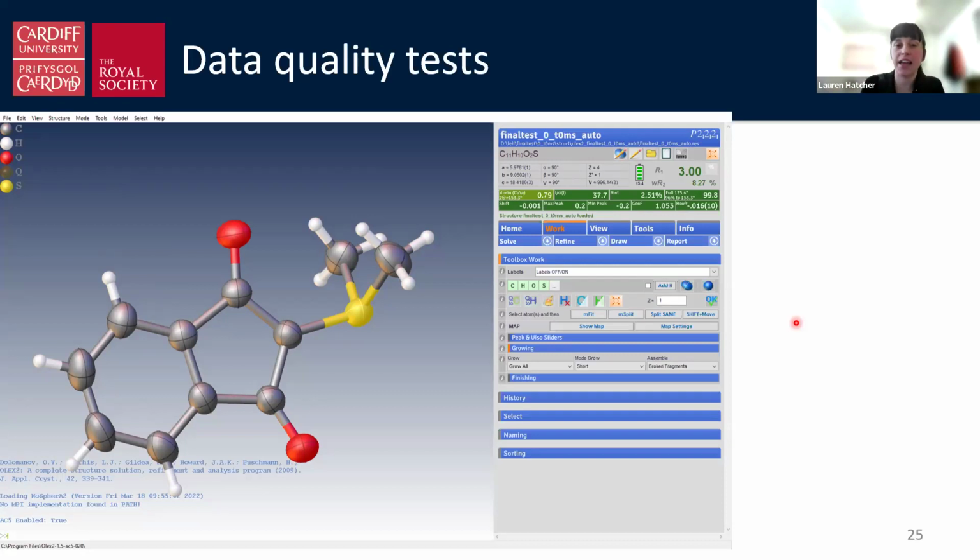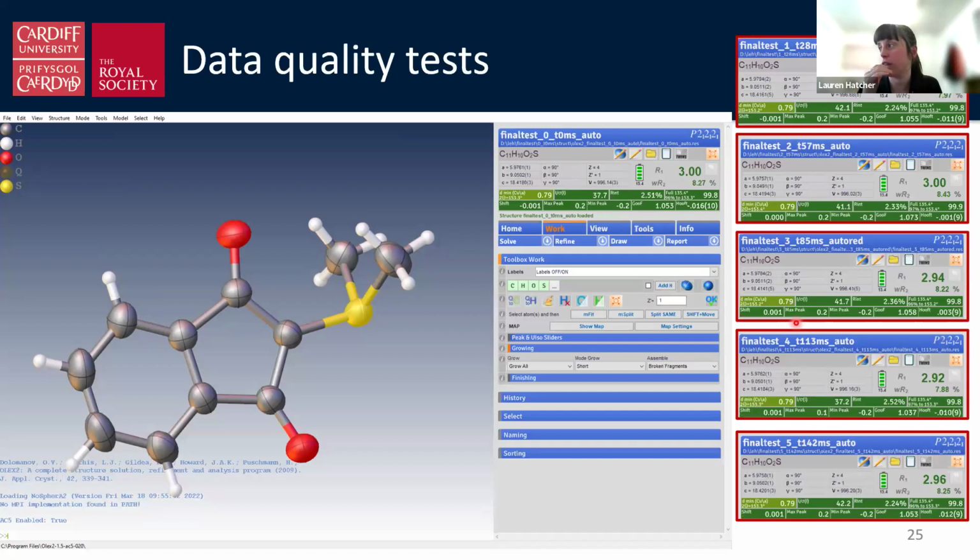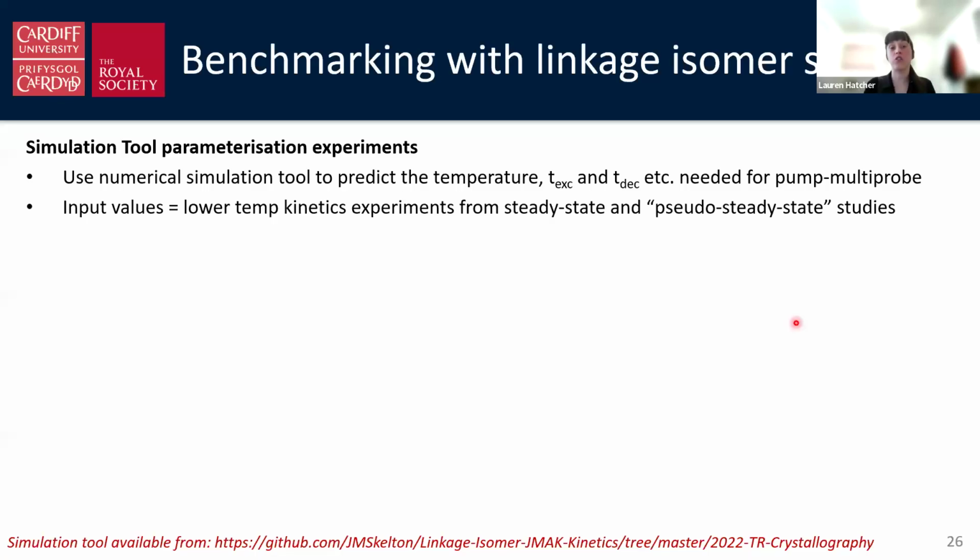Okay, if we process all the data, all 6 of those different time delays, you see we've got really very comparable data going on here. Nothing really that isn't within error. And we're happy we've got some really nice data quality here. So this all confirms that we can get some really nice standard experiment data at millisecond time resolution from the equipment. Then we went on to try and put lights in and a photoswitchable crystal and see if we could basically achieve the same kind of results as we saw at the synchrotron.